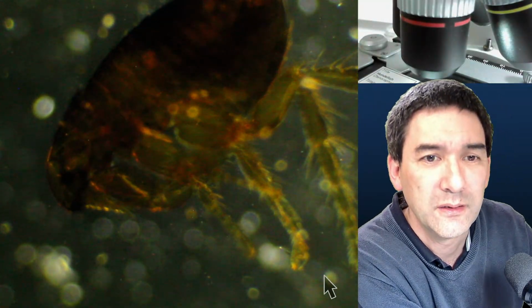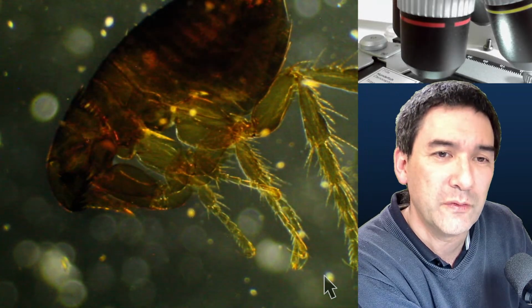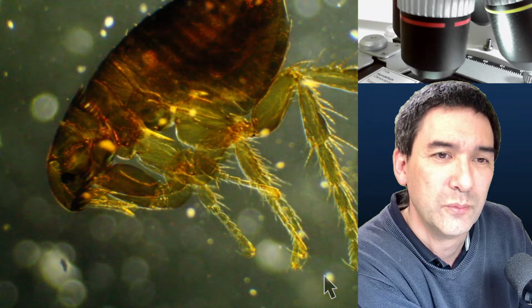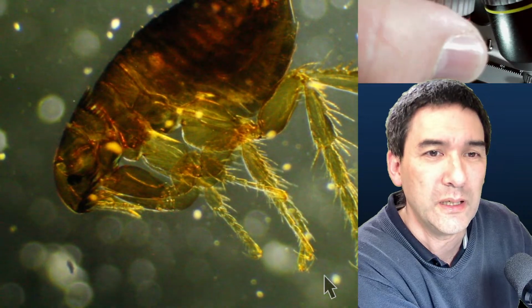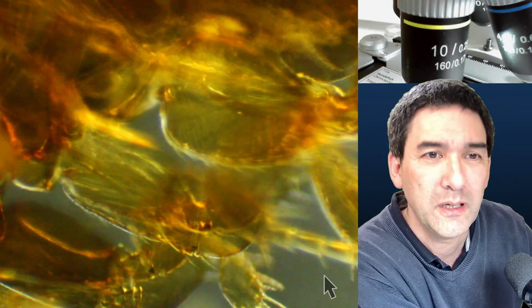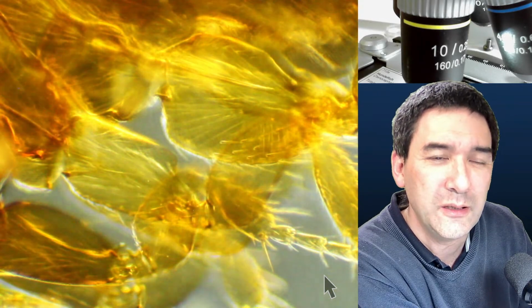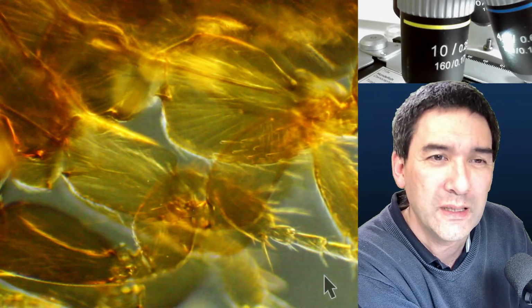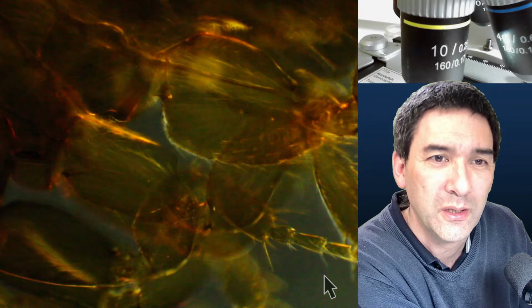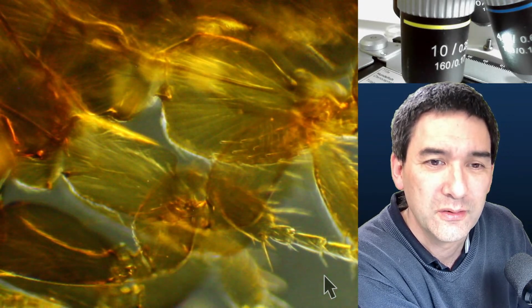I'm going to move this a little bit to add a little more light. Yeah, we're also able to see them now. But it is not completely dark field. I open it up a little bit to allow a little more light to go in here as well, because otherwise it would be too dark.